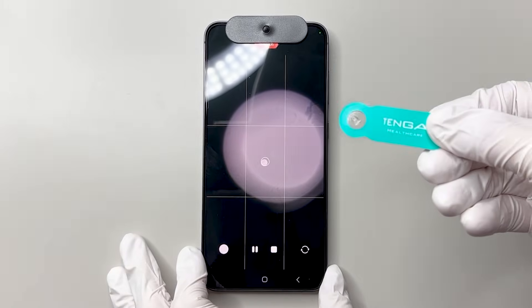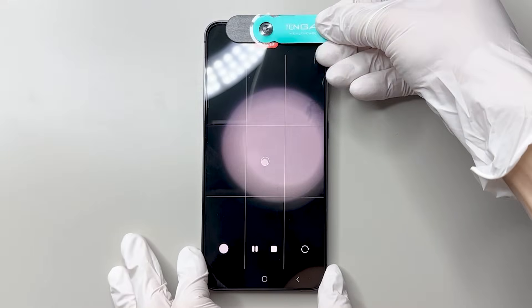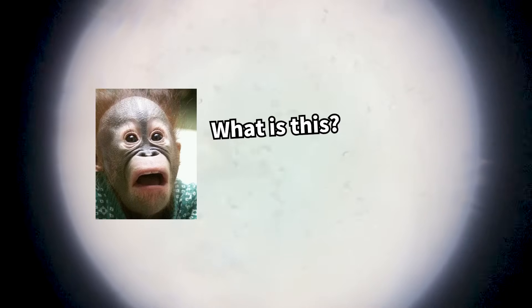After 10 minutes, I took a bit of the clear semen and placed it under the magnifying lens. Can you see it? You can observe the sperm swimming around. Unfortunately, I could only tell whether sperm were present or not, which wasn't enough to check the count or quality in detail.